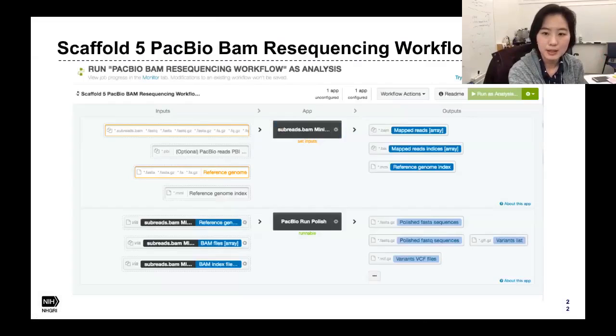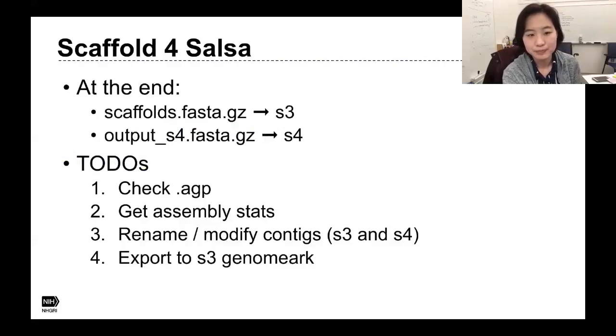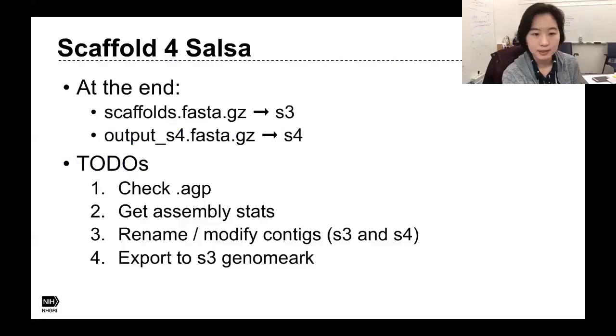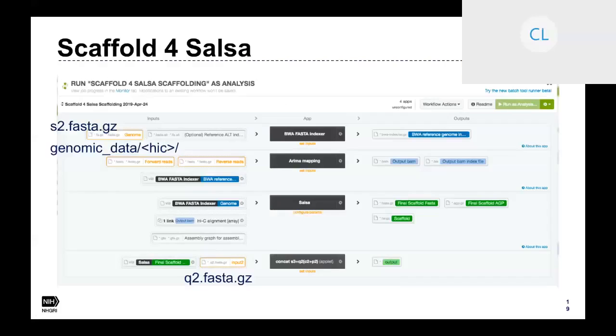Can I ask something? Sure. I have some question on input of SALSA. Okay. Yes. After finishing the BioNano, then I got the FASTA file and trimmed FASTA file. What is the difference between both files? And how can I choose for the input?